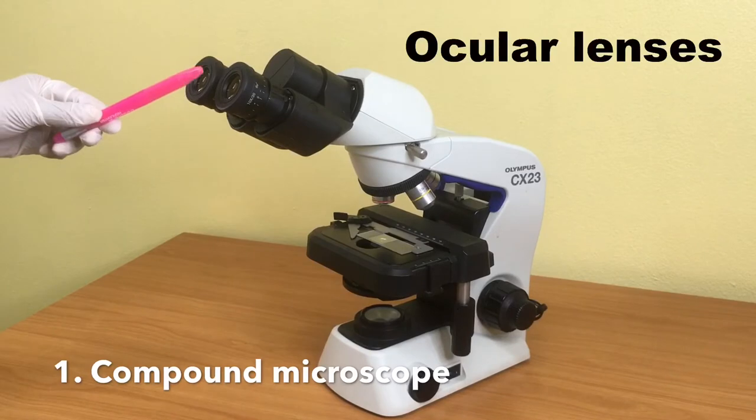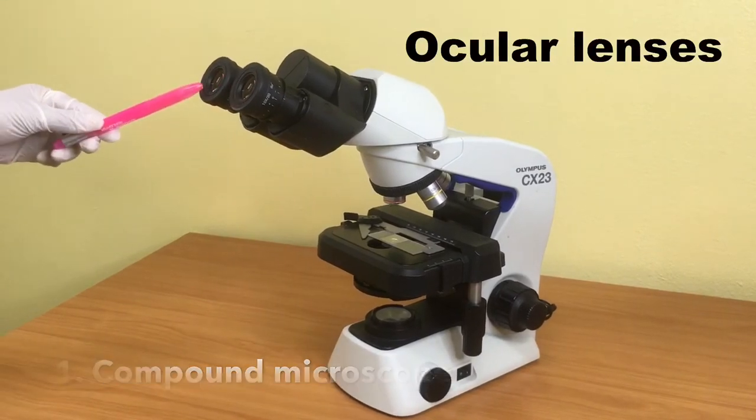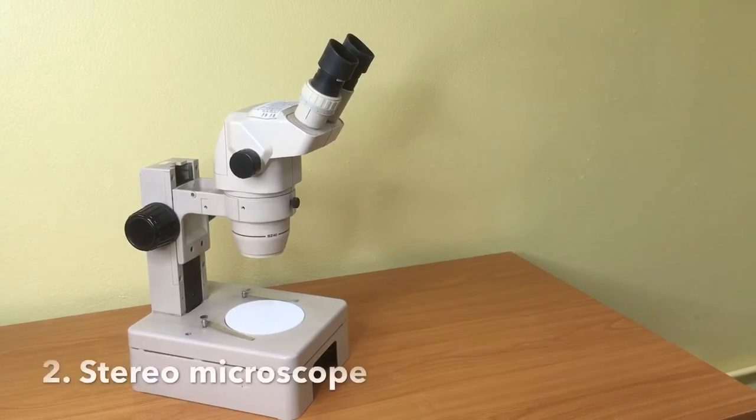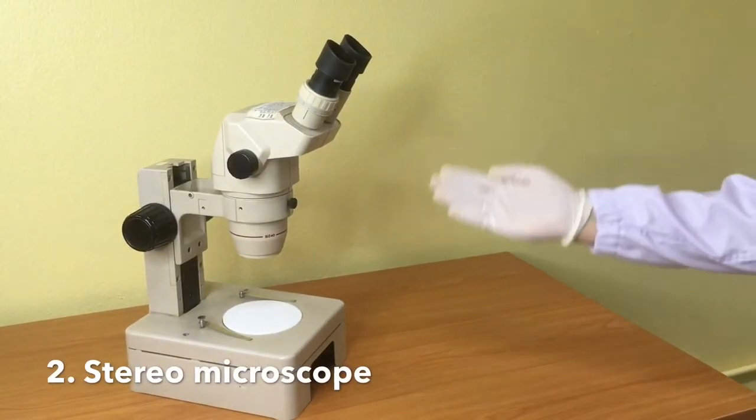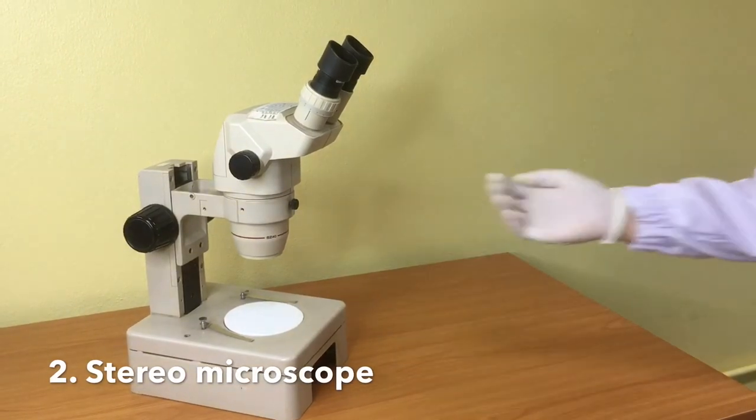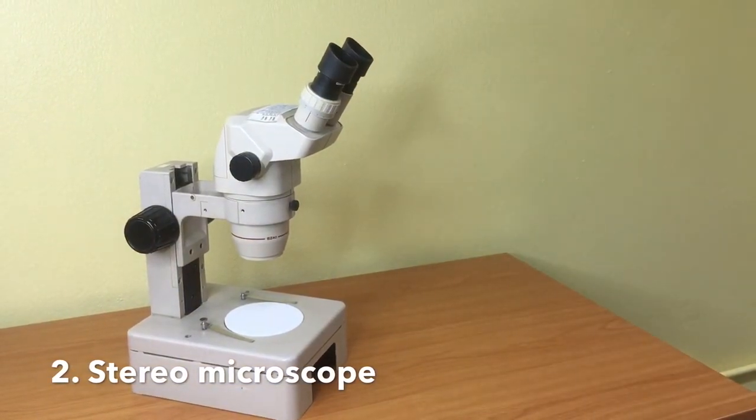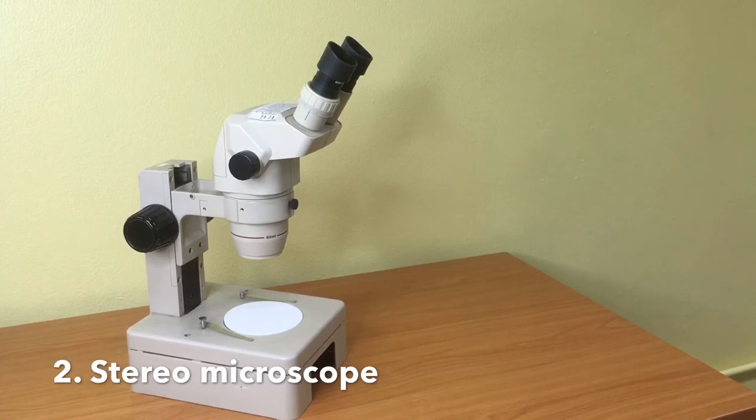Here is a binocular compound microscope with twin ocular lens. Here is the second type, which is called a stereoscopic compound microscope. We usually call it stereomicroscope.